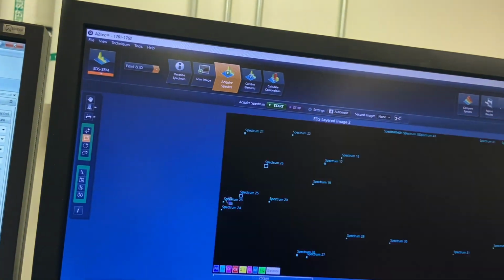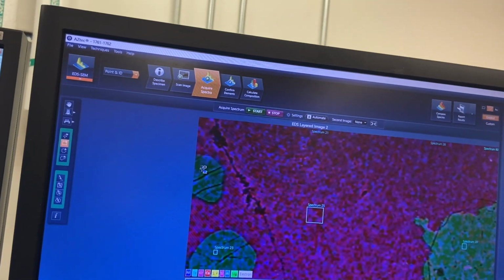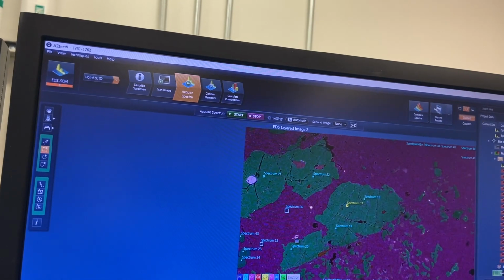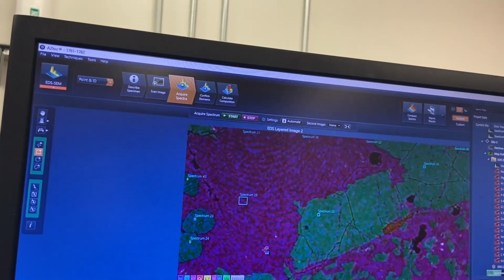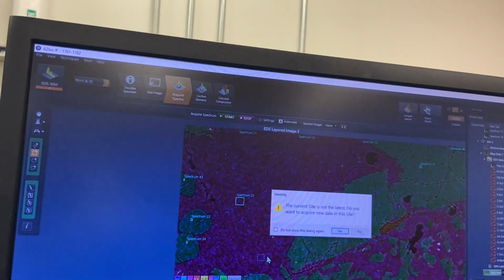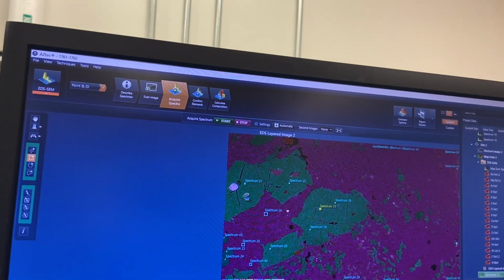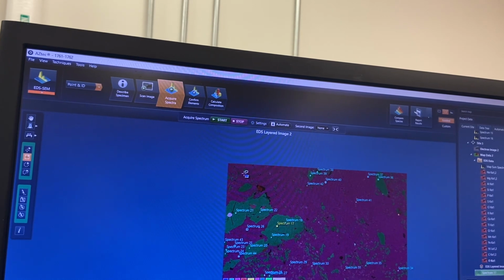all right, let me get that third spinel. Why not? Yeah, sure. And let's see. Let me get one more feldspar here. There. Cool. So we got 44.